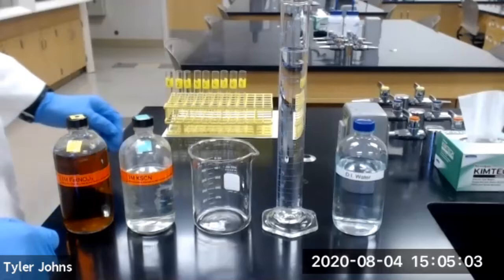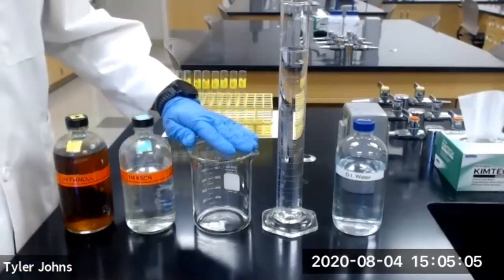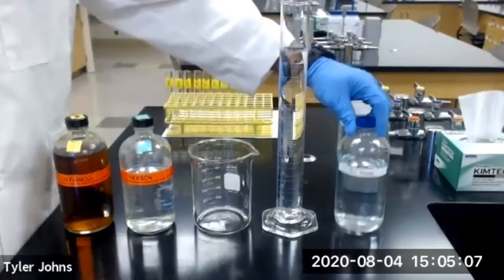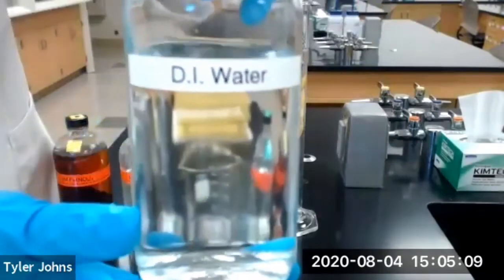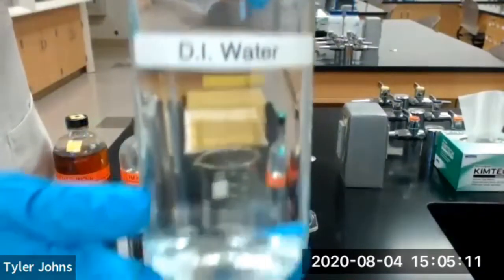We're going to start by making our stock solution in a 600 milliliter beaker. We'll first add 250 milliliters of deionized water.